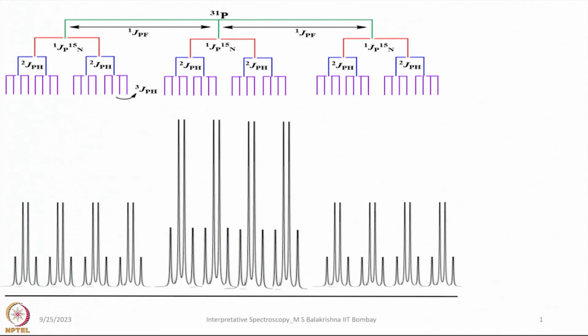As I said, once you write a clear structure, even if only the molecular formula or structural formula is given, try to write the full structure showing all the bonds and then start analyzing all NMR active nuclei, how far they are from the one we are looking into, and the little information you have about the magnitude of the couplings. No matter what, 1J coupling is always larger than 2J coupling, then 3J coupling.